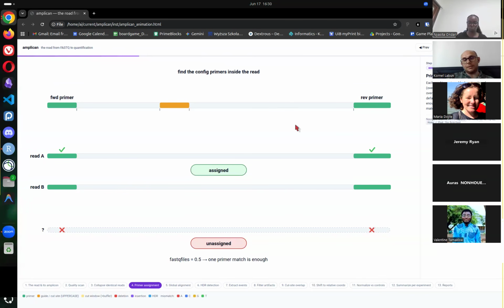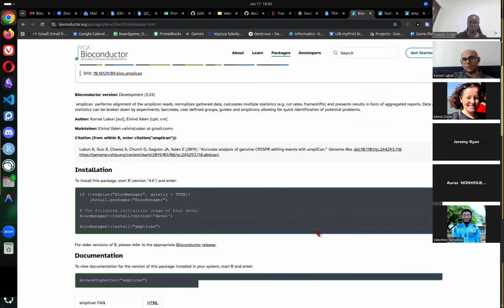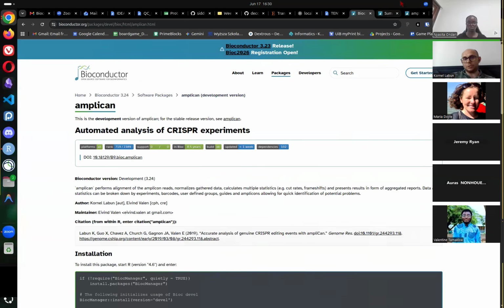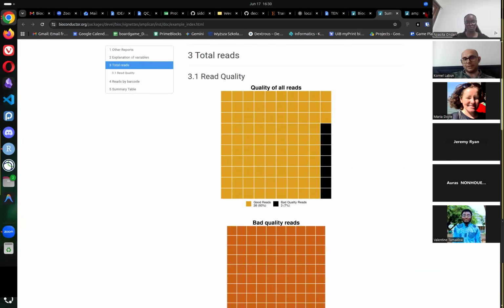And you can load events the same way I'm loading them in these reports. So you can take a look at how it is done, or you can ask your large language model to do it for you. It will show you how to load the event files.